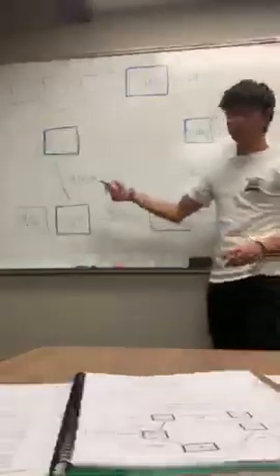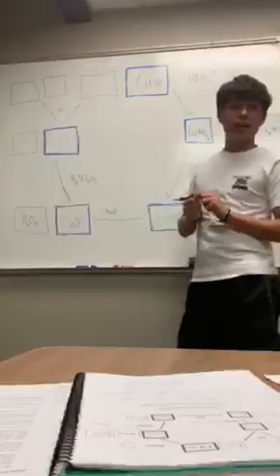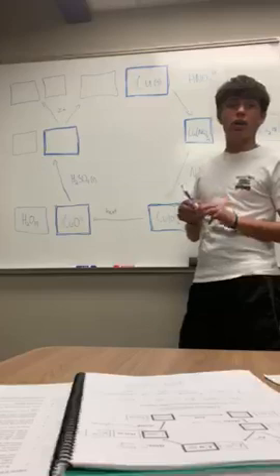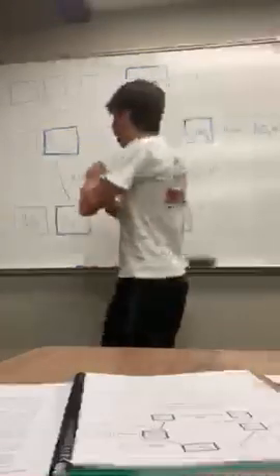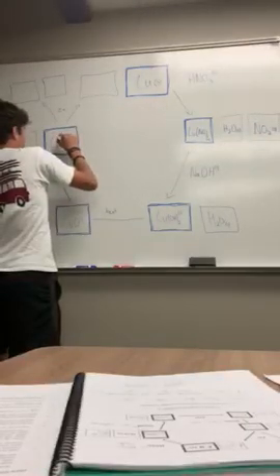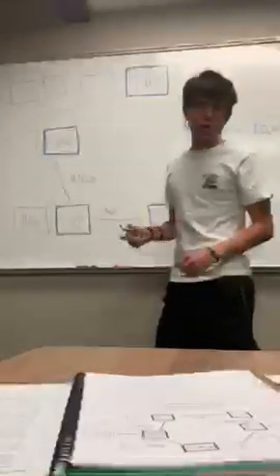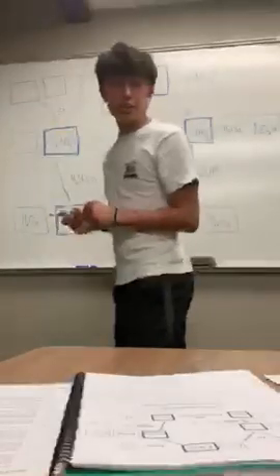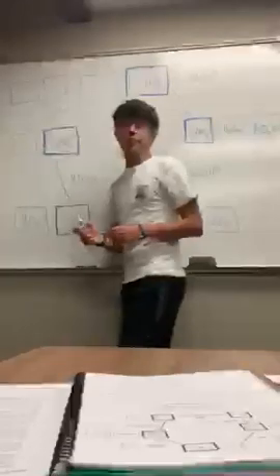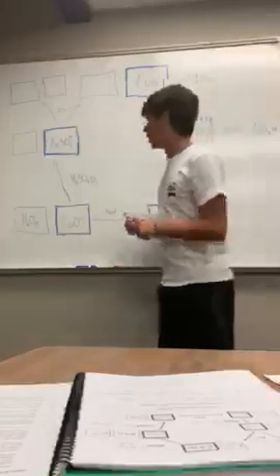Then sulfuric acid, a liquid, was added, and it dissolved the precipitate, and the liquid turned back into a bright blue color, which was copper sulfate. This was an aqueous solution. The liquid that was left was water.